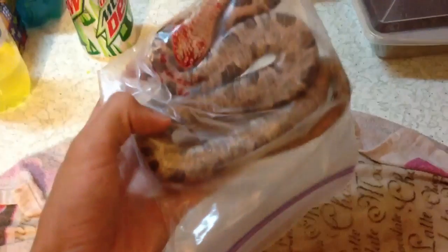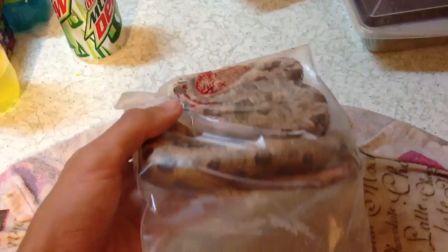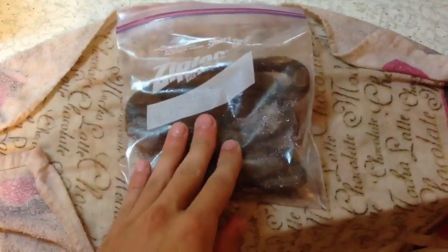The first thing you want to do — this is a copperhead I caught, well not caught, but a dead-on-road find the other night. So I froze it, and then I'm going to let it thaw out right now, and I'll show you the next step from there.